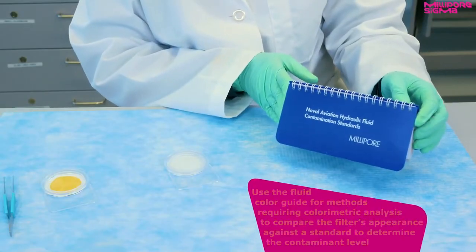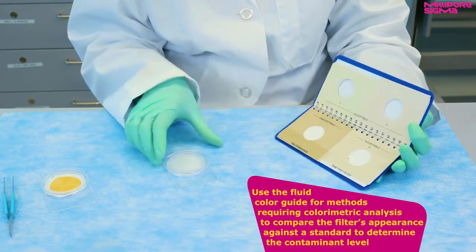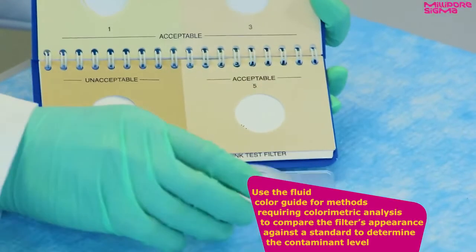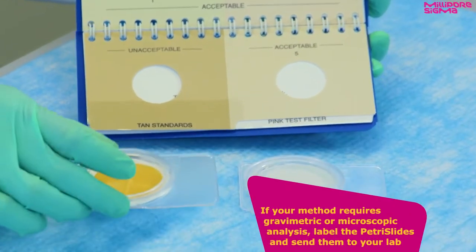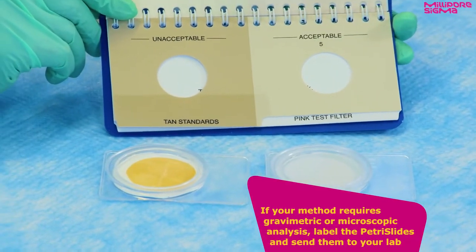Use the Fluid Color Guide for methods requiring colorimetric analysis to compare the filter's appearance against a standard to determine the contaminant level. If your method requires gravimetric or microscopic analysis, label the Petri slides and send them to your lab.